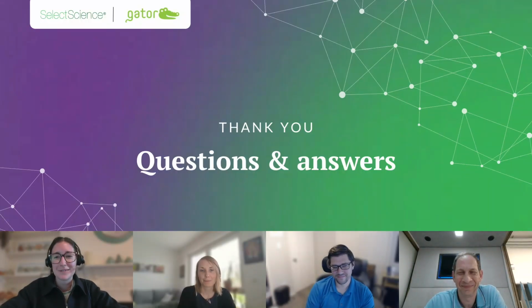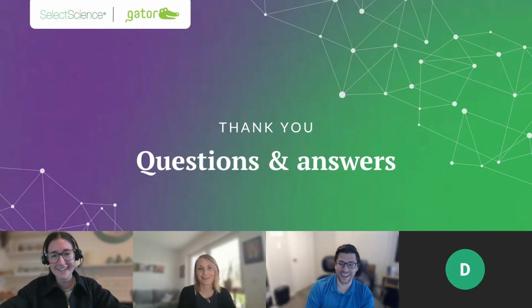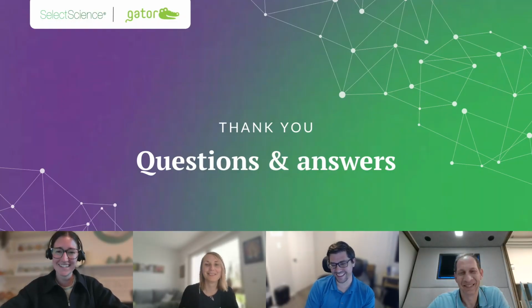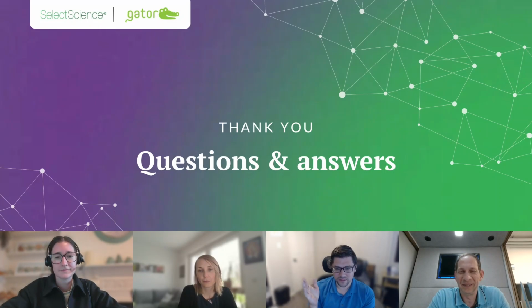And I've got another question here for you, Ben, as well. What's the throughput per week for a Gator BLI instrument? Actually, Ron is also very well versed in that. Okay. Well, yes. We're talking on the order of thousands, right? And you said you're running 4,000 a month right now, Ron? Yes, we have like 4 BLIs, but we have also other instruments, etc.